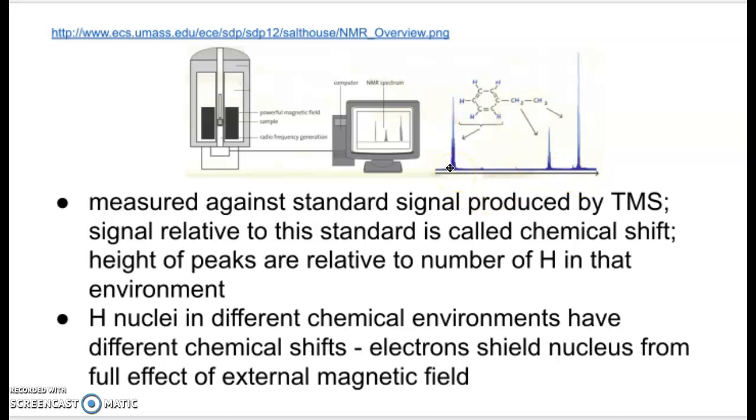This one over here, again, hasn't been integrated, and so there are actually 5 hydrogens that all have the same environment. But since this hydrogen over here is closer to the CH2, it and its partner up here probably have a little bit different signature, and that's what's causing it to have a triplet signature instead of a single signature. So even though these 5 hydrogens are all part of this peak, they spread out a little bit like this. Again, for the purpose of our exams, they clean up that information and they'll give you one very, very tall peak that represents 5 hydrogens.